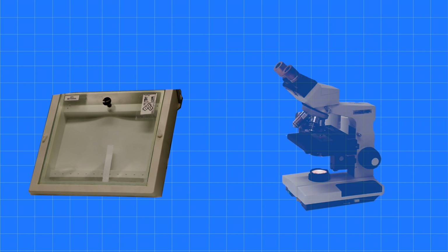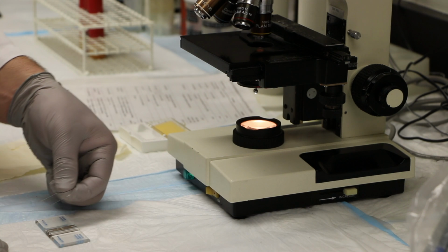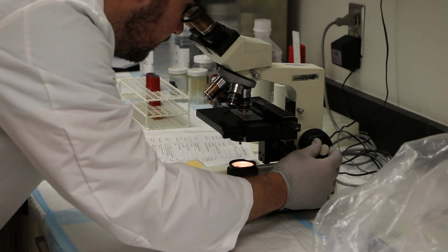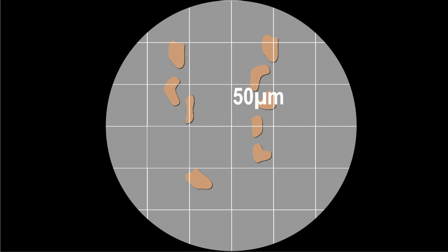The MAA test requires both a labeling efficiency test using the MEK solvent as well as testing the particulate size. Place a drop in the center of the hemocytometer slide. Cover the droplet with a cover slide. Examine the sample to observe the size of the particles. Each reference grid is 50 microns square. For this example, the acceptable limit is a particle size of less than 150 microns.